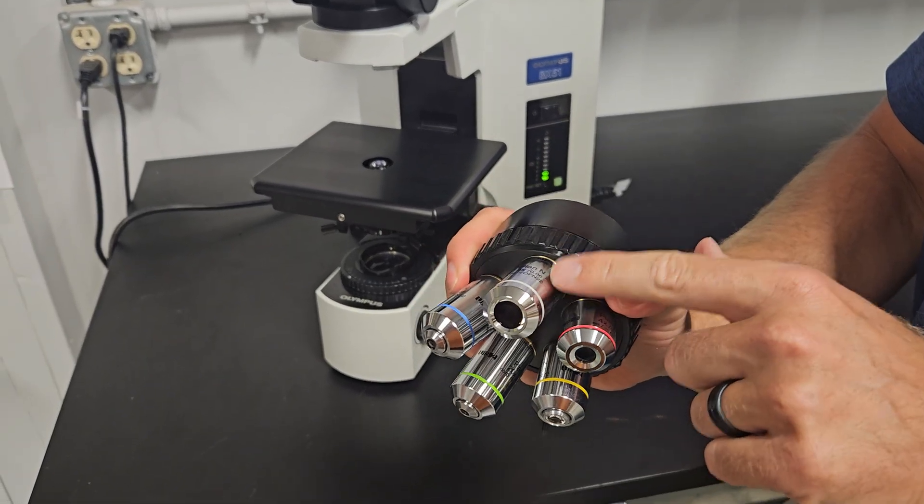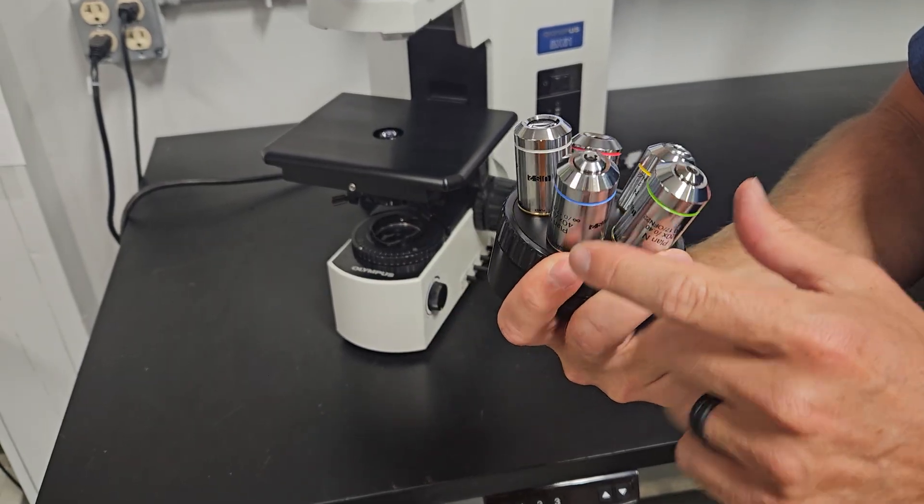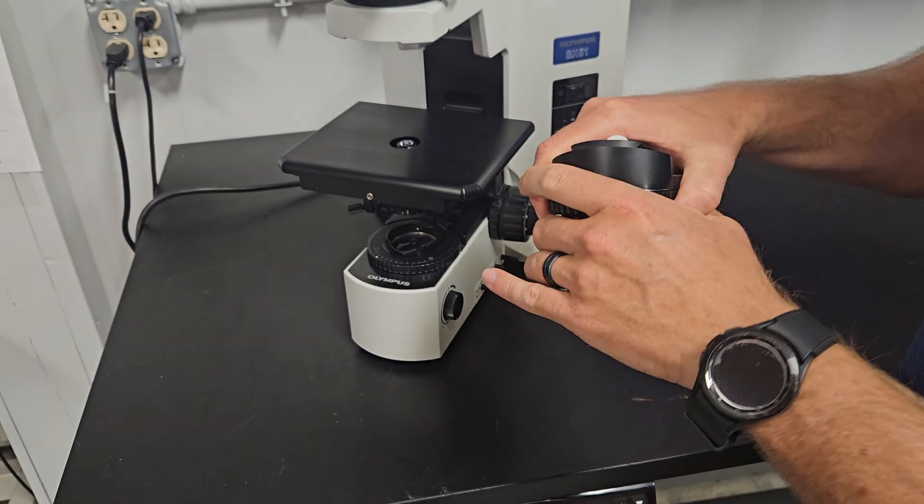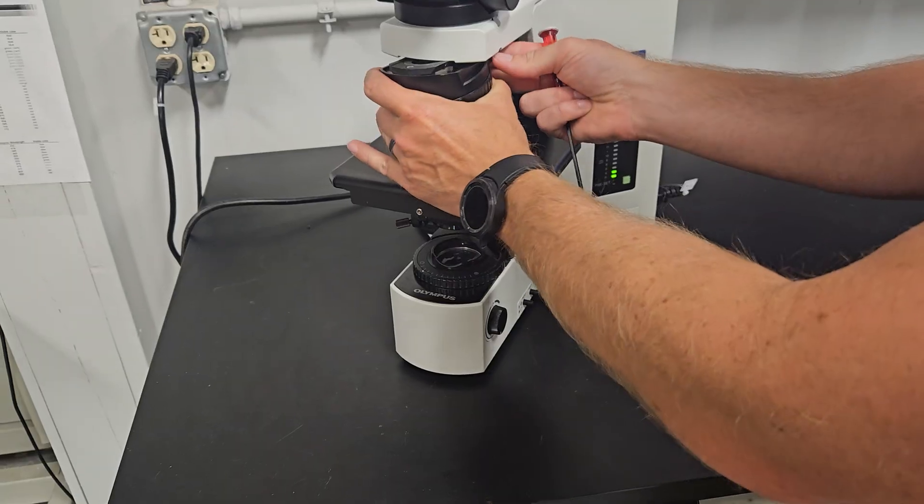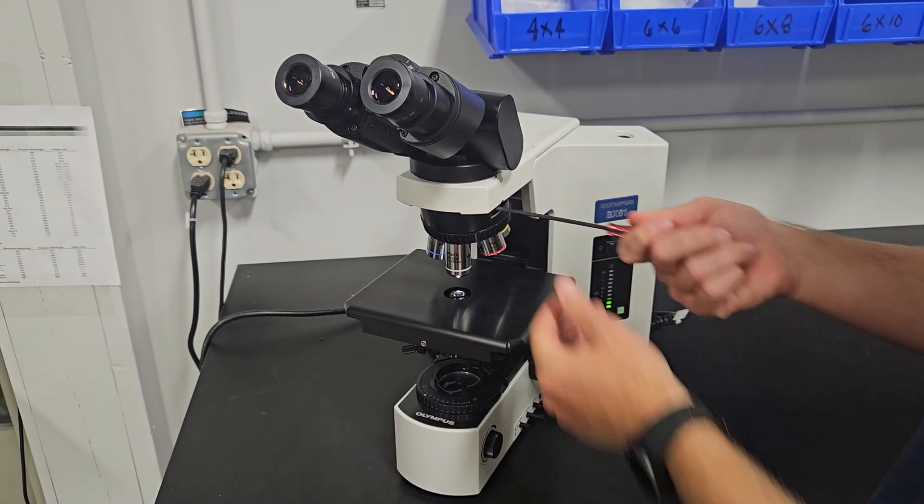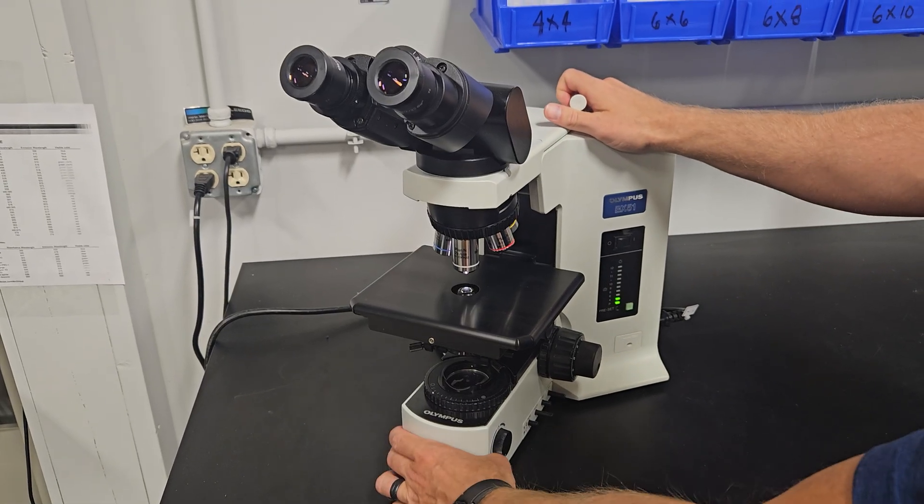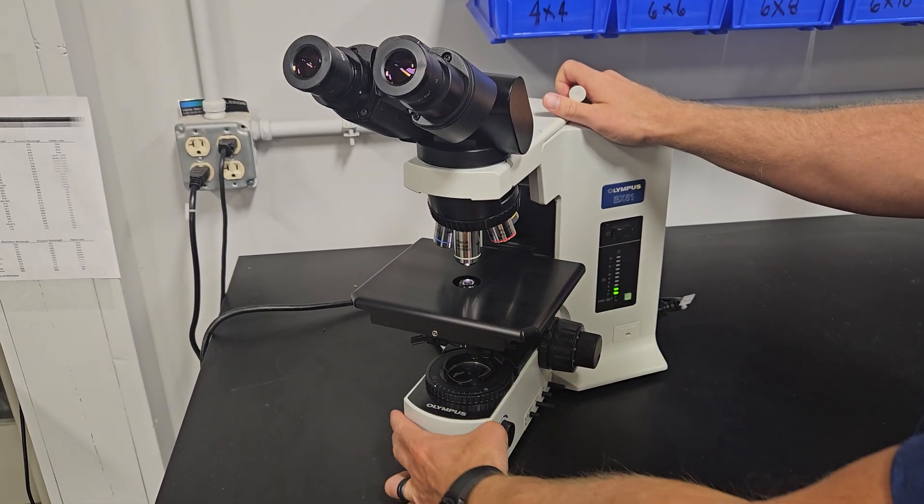Since it's set up for a pathologist, we have a plan 2X, 4X, 10X, 20X, and 40X objective. You might have a six place nose piece on your scope. If you need more objectives, you might have a different objective configuration, but we're just showing you what this particular pathologist wants or Mohs surgeon. 2X is very important to them.